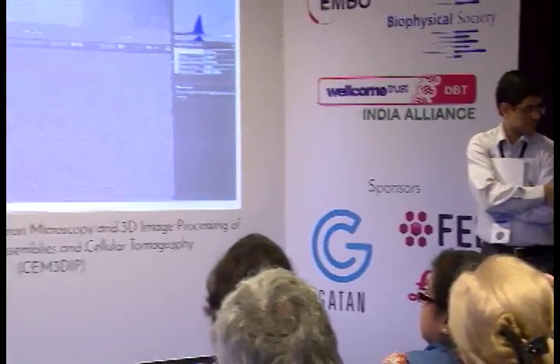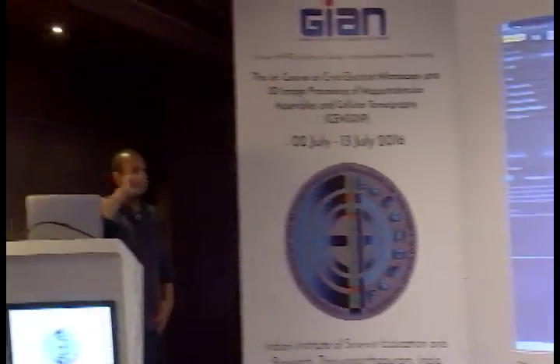Does EPU handle autofocusing in the case of carbon and gold grids equally well? Yeah. Gold grids are fine as well. They, in fact, have a very good signal, so they can focus perfectly well. The only thing with gold grids is when you do coma-free alignment, then you need some amorphous signal like carbon to do that. But focusing is not a problem. Okay. Thank you.